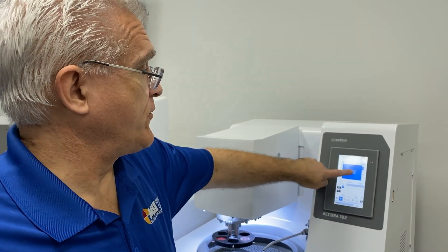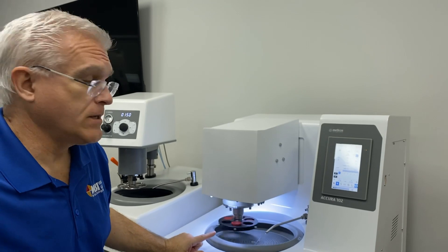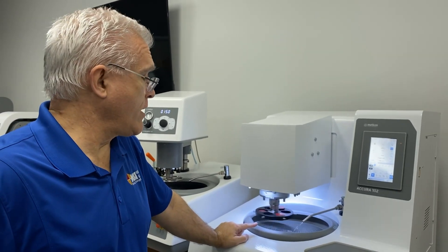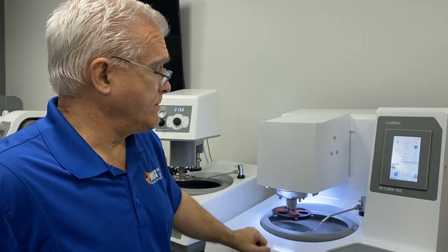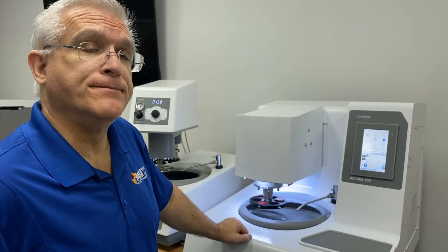Once the process is done, you can initiate an automatic cleaning process that cleans off your abrasive or your polishing cloth, then it shuts off the water automatically and spins your surface dry.